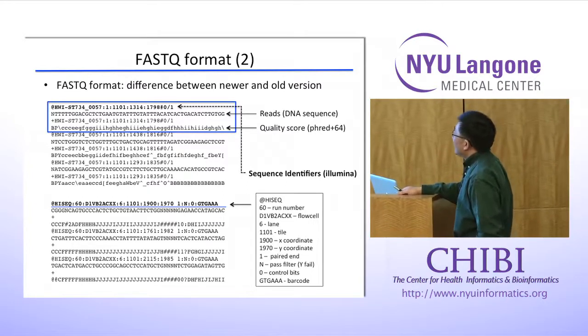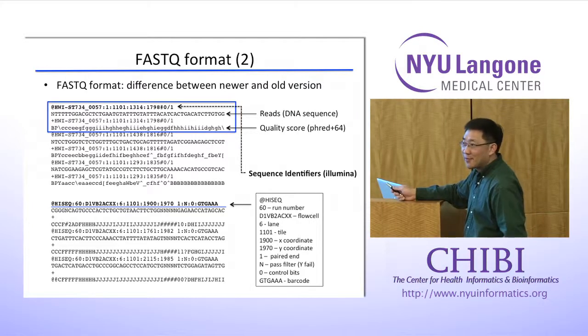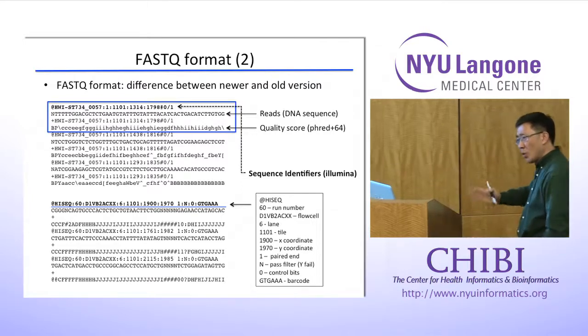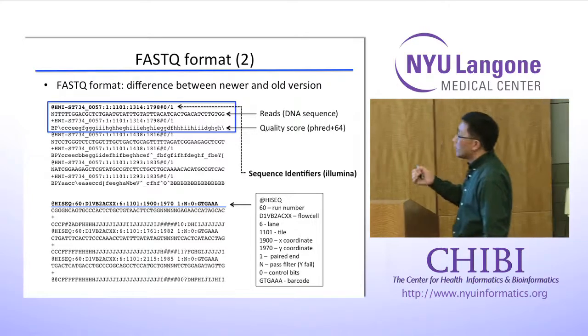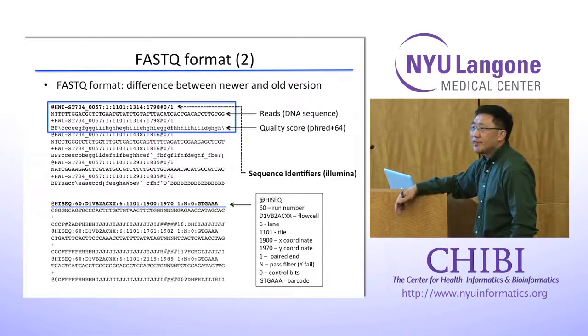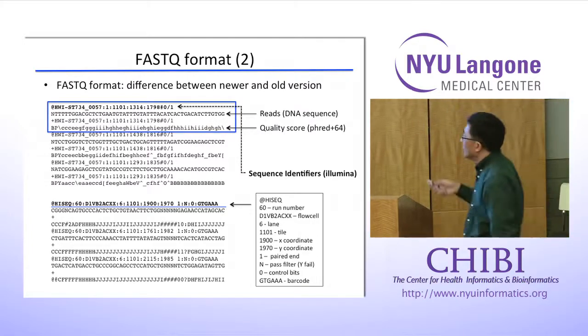Then, following that is the flow cell number. This is a lot number for the flow cell, just in case some type of technical issue comes up with your result. So they can trace back what lot of the flow cell you used for your experiment, and whether this is your problem or the manufacturer's problem.